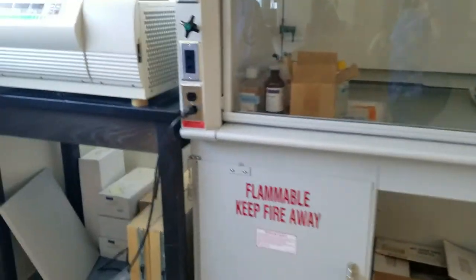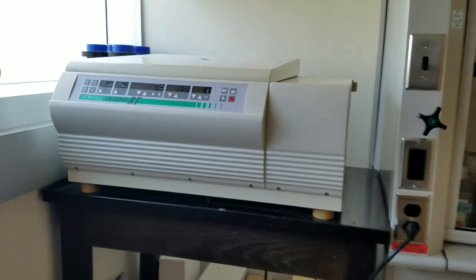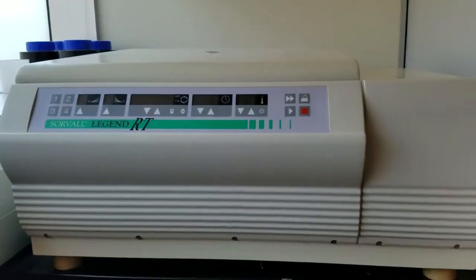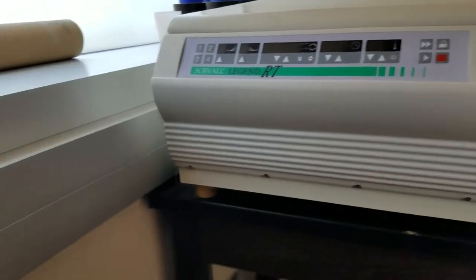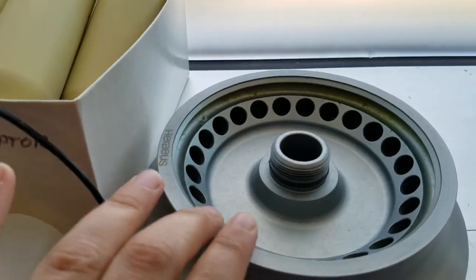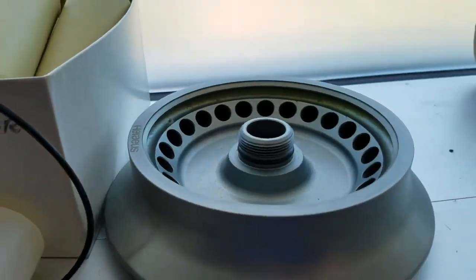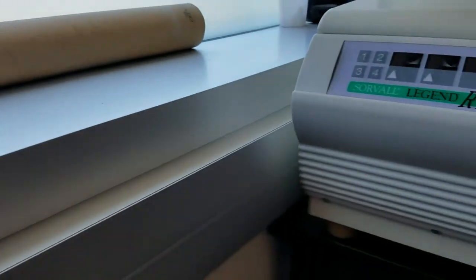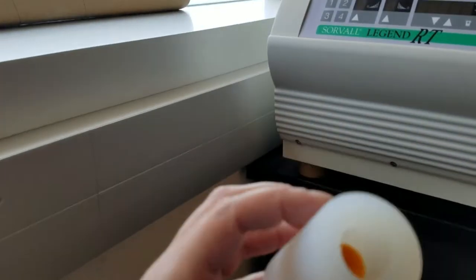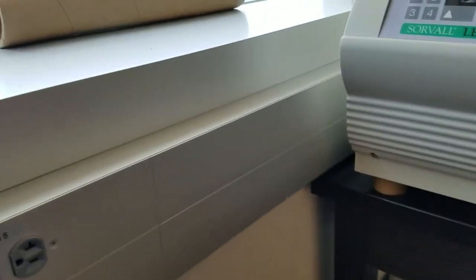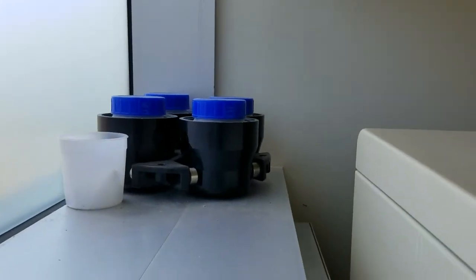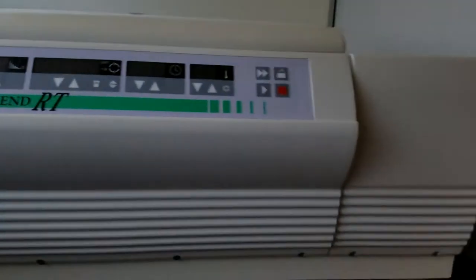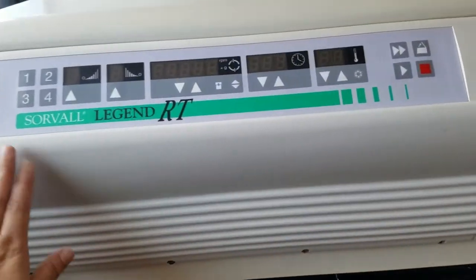Next I have a huge centrifuge, a larger centrifuge here. This one can be used to not only use the little tubes like the 2 ml and 1.5 ml, but I also have adapters to use them with 15 ml tubes, 5 ml tubes, and even 500 ml bottles. So we have different adapters for this one to use all kinds of different types of tubes for our centrifuge needs.